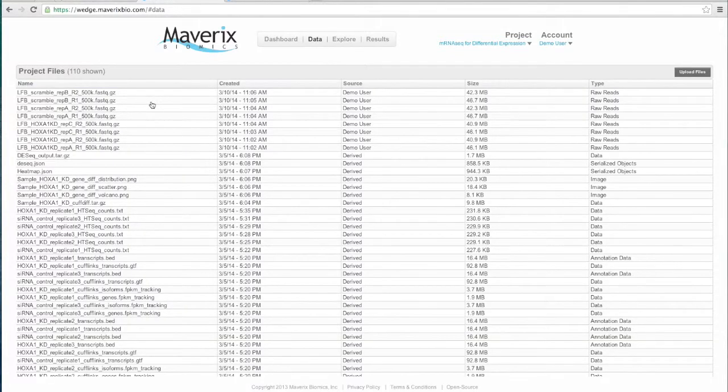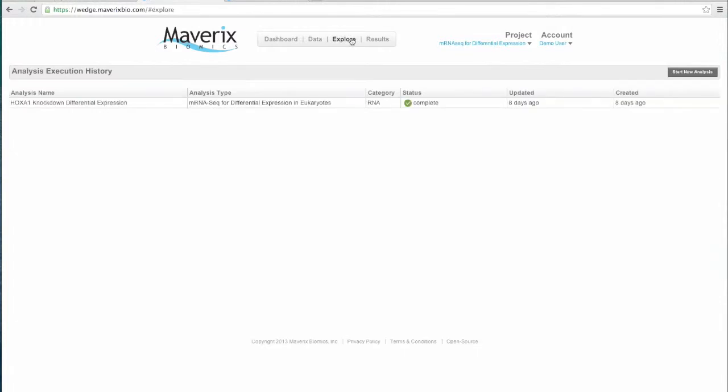So once you've uploaded files, you're ready to move to the stage where you actually begin with the analysis. Before I get to that, what I'll do is show you really briefly these final 2 sections on the platform. The Explore tab, this section within the platform, is where you would see any of the analyses that you had run on the platform. In this case, there's one that's already been run within this project, and it has a status of complete.